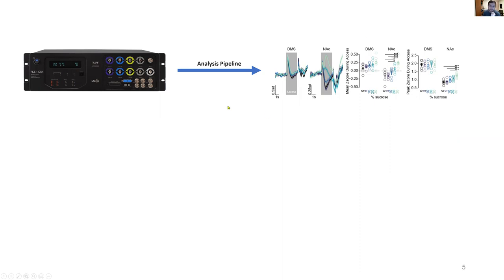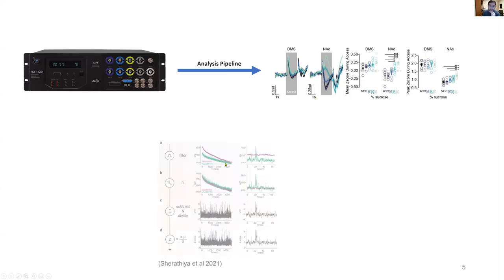And oftentimes we spend extensive amounts of time thinking about what sorts of algorithms we're going to apply to our data. For example, everything is going to be related to photometry today. So in this case, you probably think extensively about how you're going to fit your signals and then compute your normalizations on top of that. But this can be more elaborate in the case of two-photon imaging or any other number of recording mechanisms.